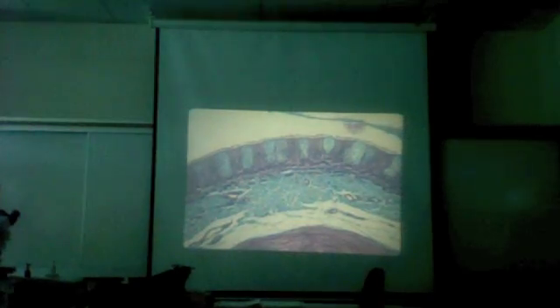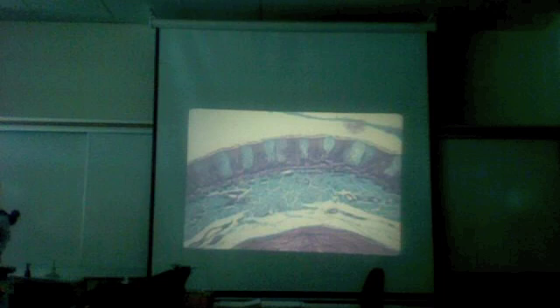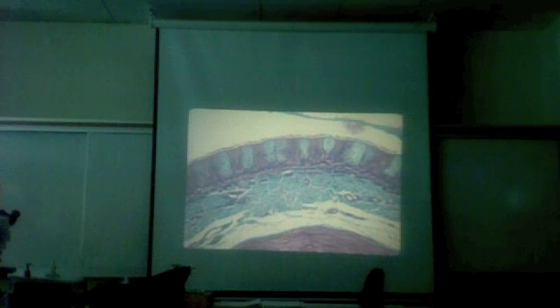Okay, what is this? A vacation spot. Okay. And these are the exocrine acinar cells out here. Okay, same old, but there's different stains, so look for the structure. Remember that? If you're in the islet of Langerhans, there's no space around the cluster in the middle, because it's not filtering anything. You don't have to have a place for filtering.